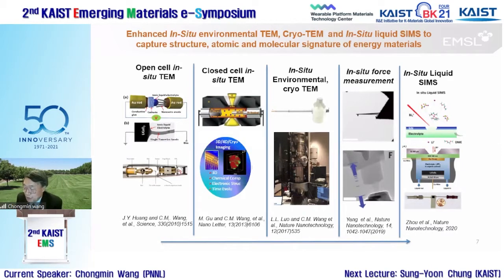As Dr. Lu just mentioned about lithium air, we can do the lithium air battery as well in here. And definitely, I think Professor Yi and Shirley actually inaugurated the use of the cryogenic microscope for battery research as another domain direction. At the same time, we integrate different techniques. For example, we integrate force measurement into the microscope, environmental or other microscope, and really can measure small forces in here. I will show examples along these directions.